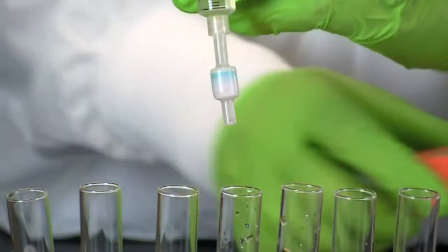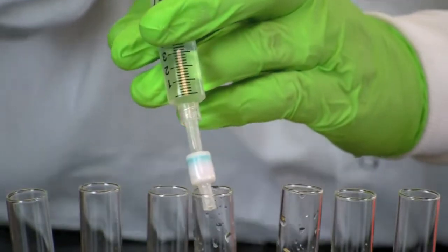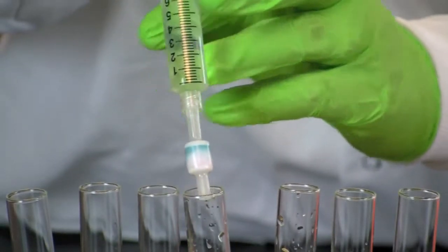Once all of the pigment has come off the column, push a final 10 ml of 25% 2-propanol through the cartridge, and collect the flow through in a final test tube.